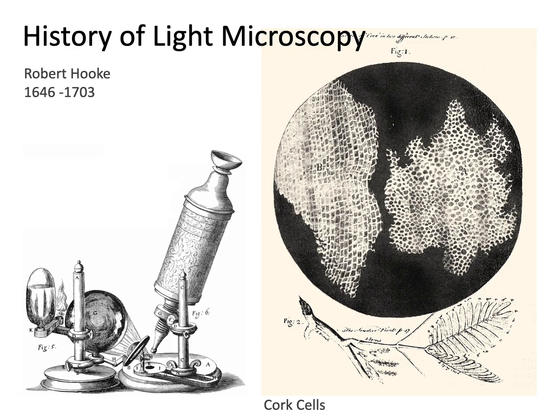So where does light microscopy come from? So we can go back and look at a little bit of historical context. So Robert Hooke was an English polymath who had created some of the first examples or use of lenses to magnify the biological world. Right? One of the things that he observed first were cork cells.